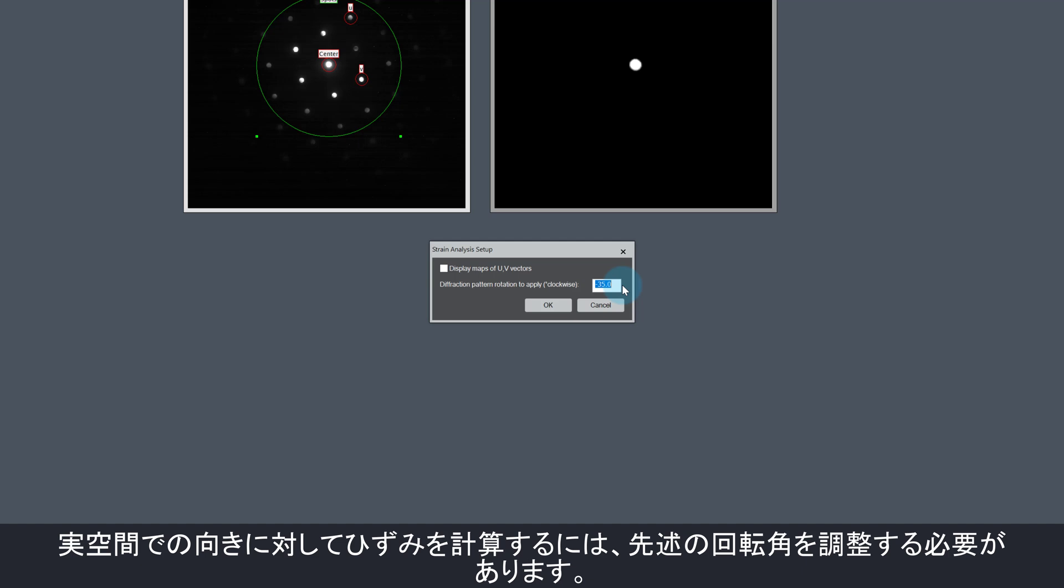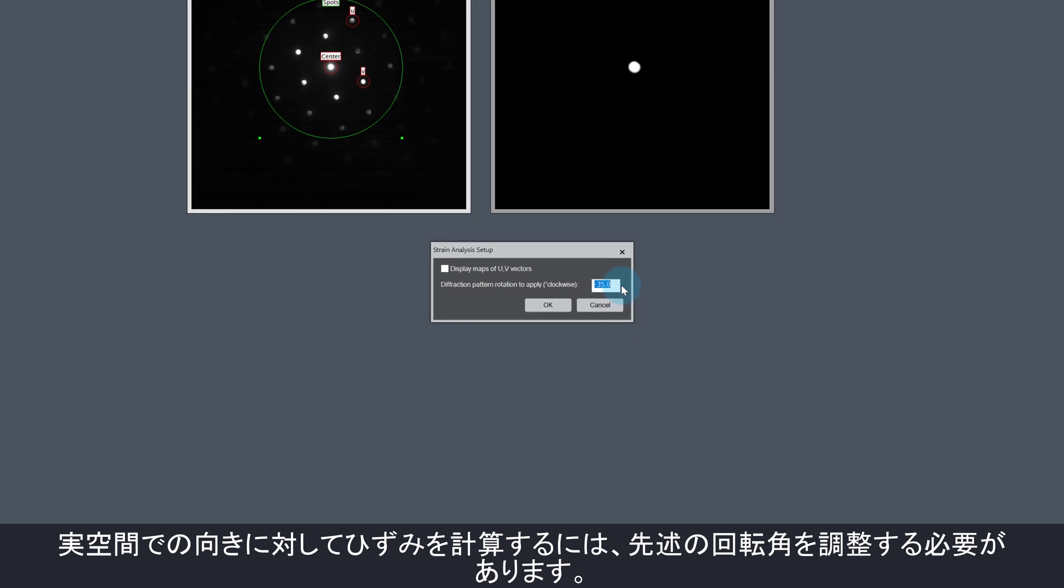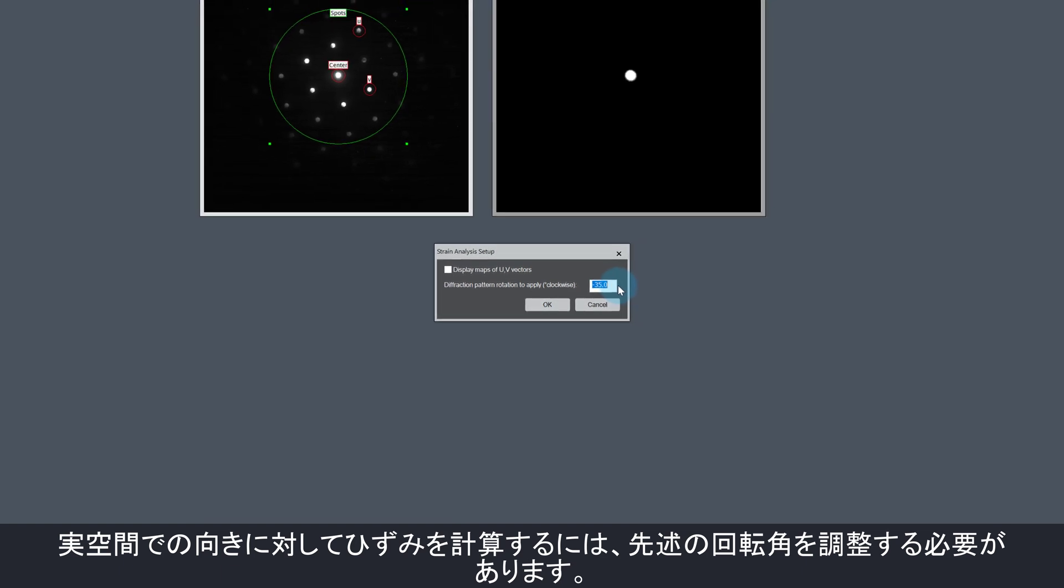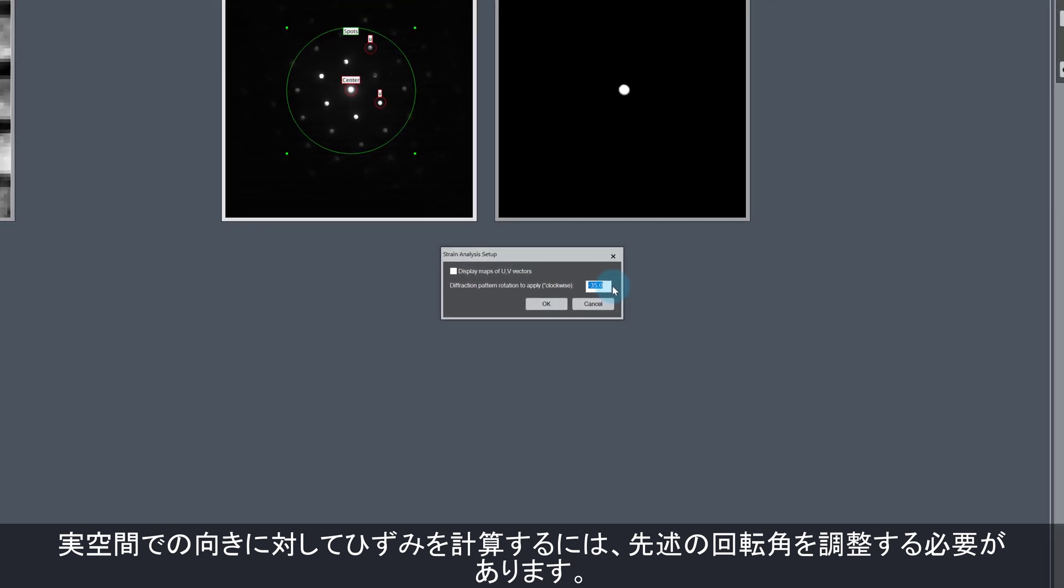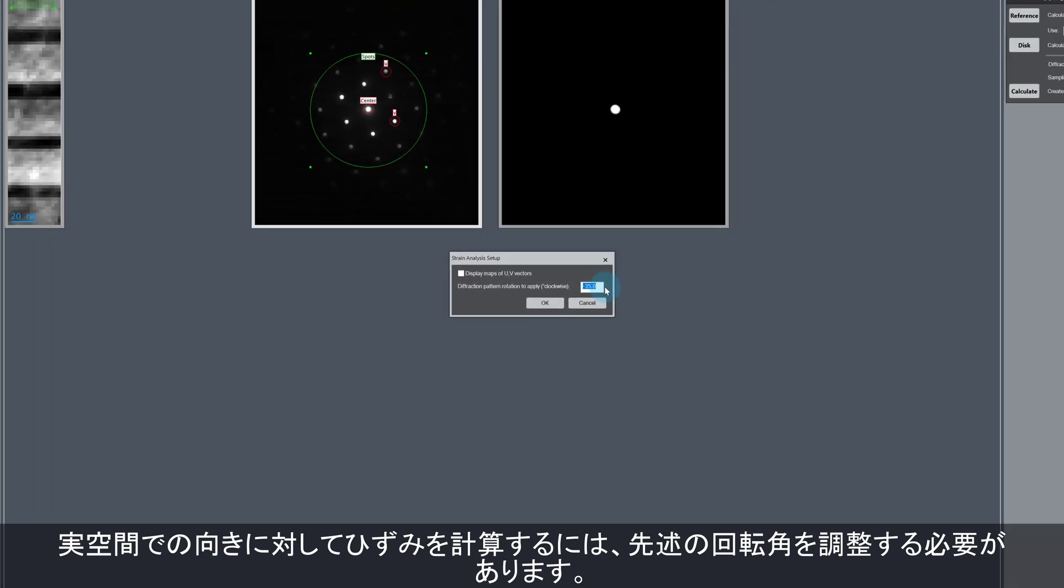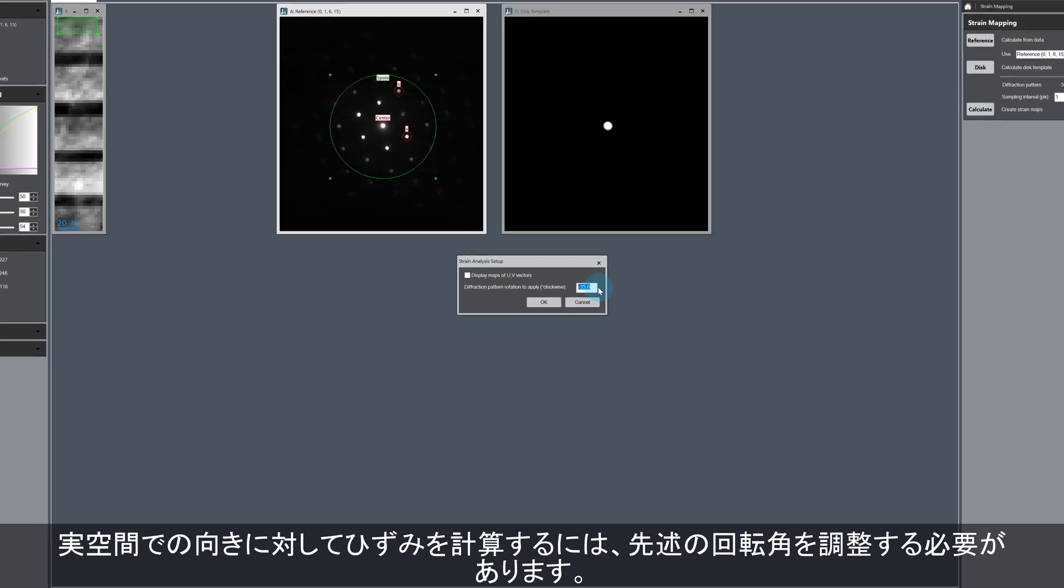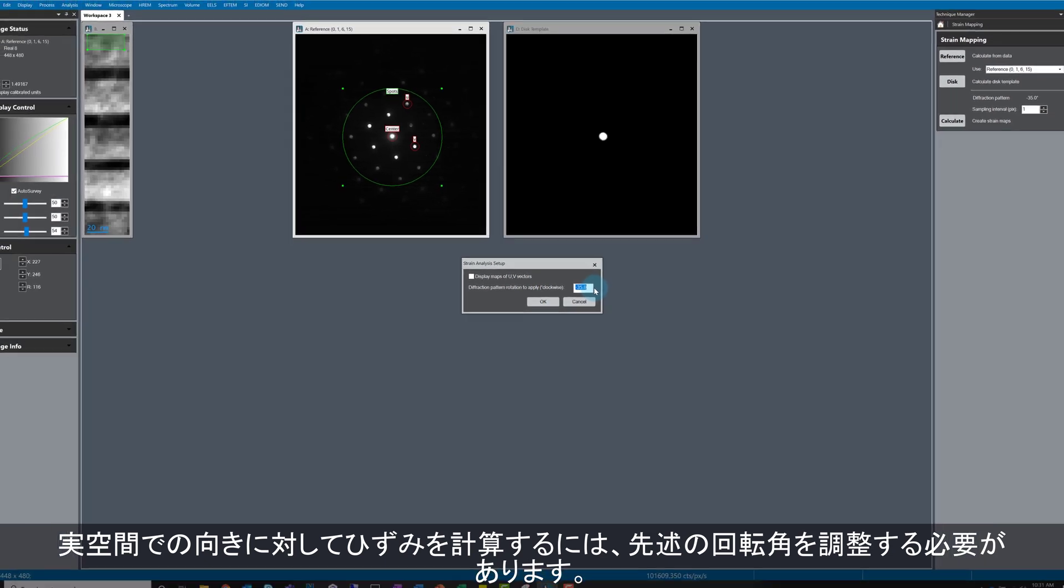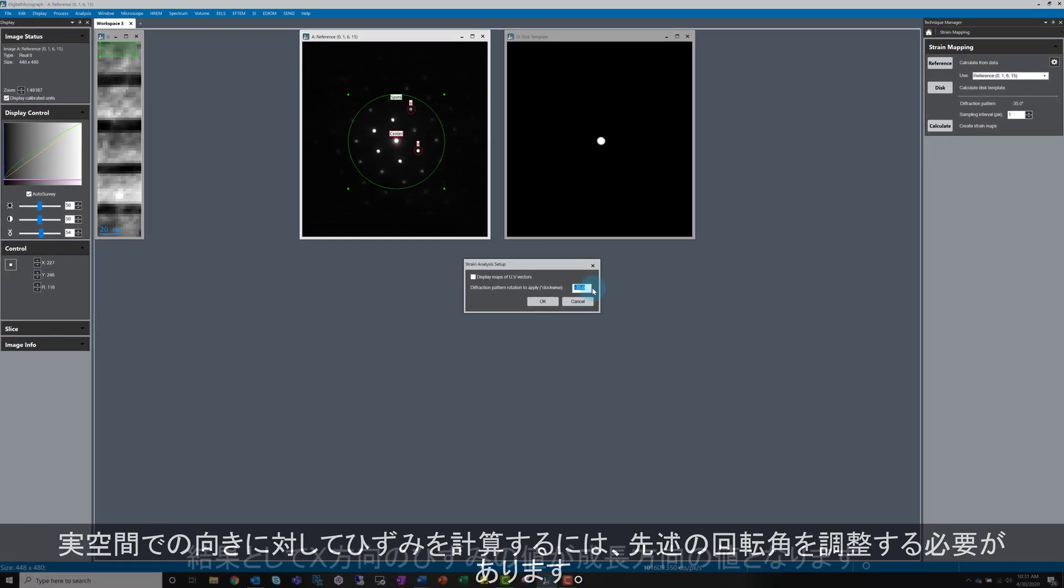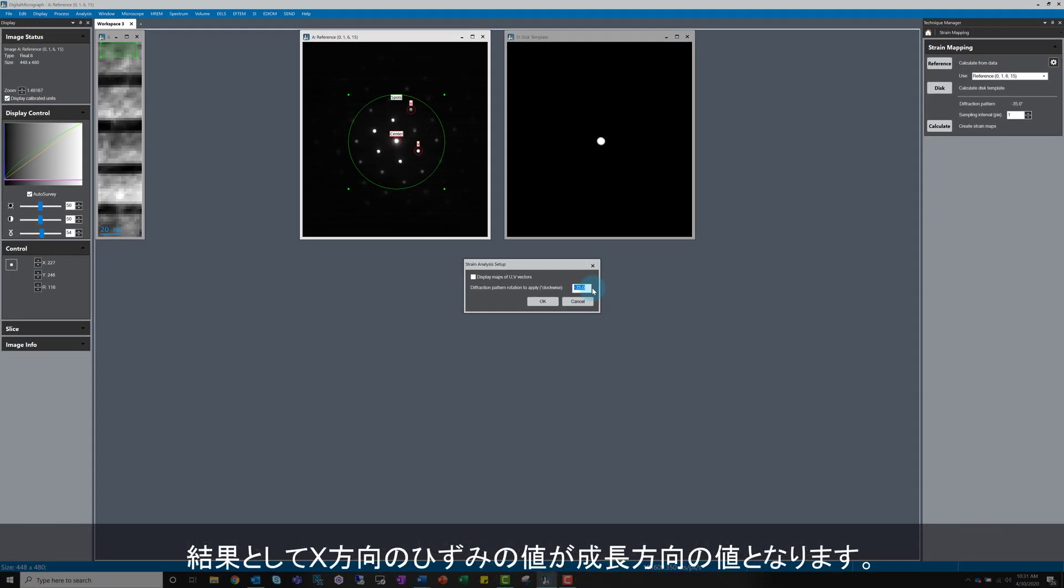So I need digital micrograph to rotate the diffraction pattern 35 degrees counterclockwise. The output strain in the x-direction will then correspond to the strain in the growth direction, which is what we want to measure.